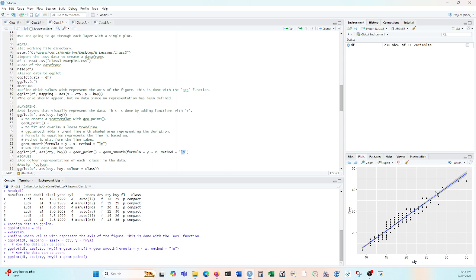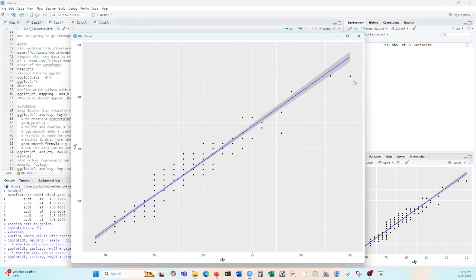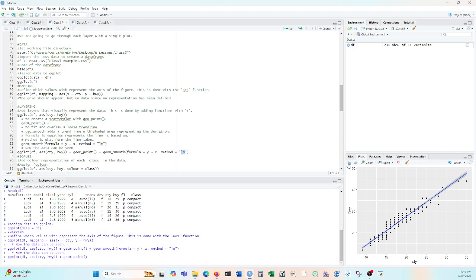And it also creates this nice area around the line. It shows a nice little area of error around the line. So very cool. Once you add layering, you actually get a visualization of the data. So only data with the mapping on it, telling you what kind of figure you want, and then finally adding on this line function.